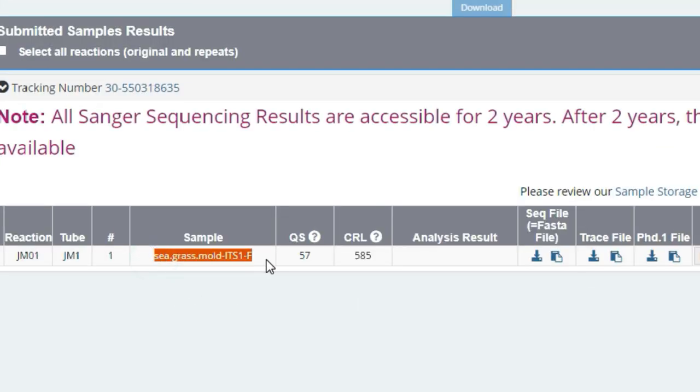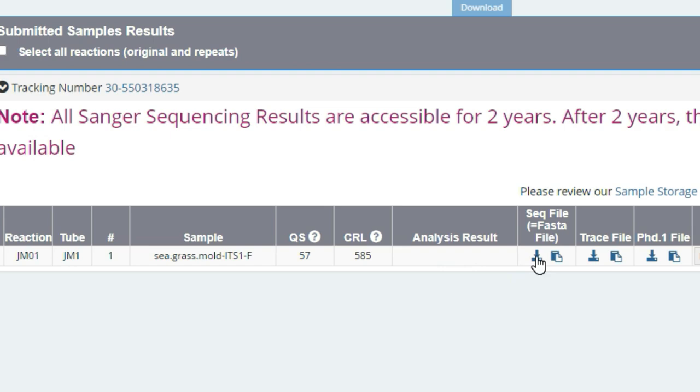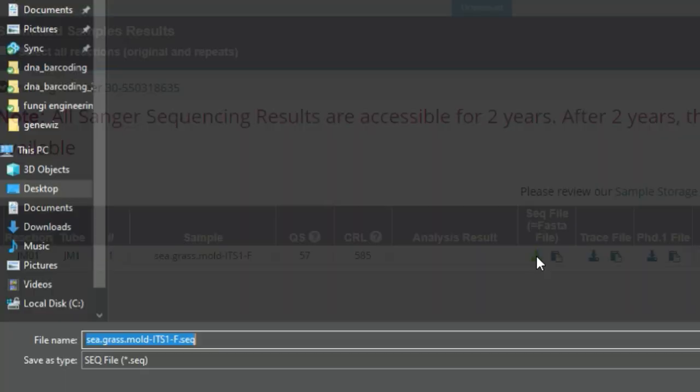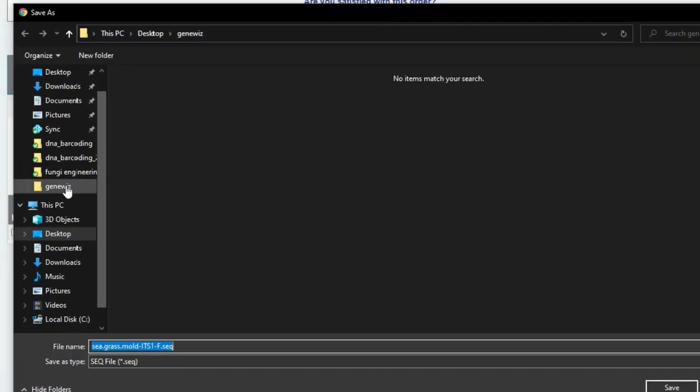And after logging into our account and clicking on view results, we'll be taken to the sequencing results page for the order where we can see the reaction, the sample, and a couple of other pieces of information such as the quality score, anything over 40 is considered good or passing, and the contiguous read length, which is the length of the sequence read, we got 585 here, as well as the various sequencing files that we'll be using to analyze our sequence.